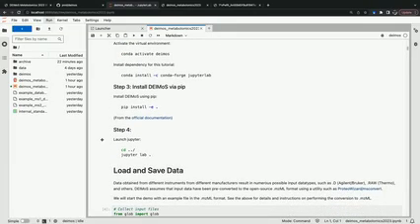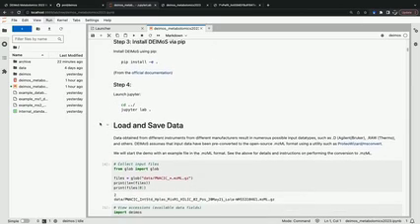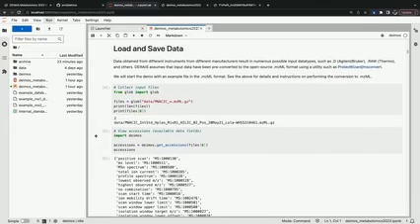And then once all of those steps have been completed, you can launch this notebook via Jupyter. And so here you can just access the directory containing the notebook and then start Jupyter Lab. This notebook is starting from that point, assuming you have followed all those steps already and are ready to now process your LC-IMS data. So as Tomáš talked about previously, there are multiple data types for LC-IMS, MS data, and different instruments from different manufacturers can result in different data types.